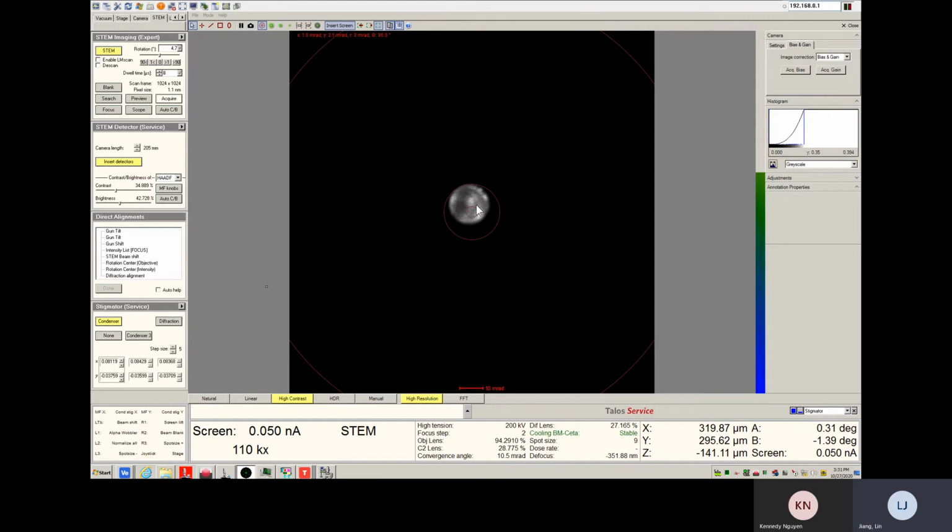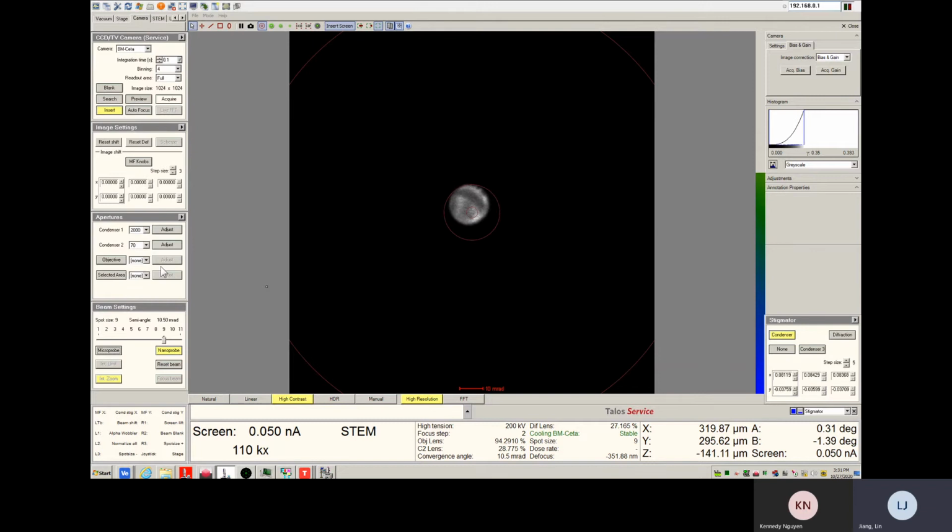Okay, and then you see you're getting close, you probably need to adjust your position of your camera a little bit. C2 position with C2. You move to the center. You want to make sure you select the center of your kick button. Okay. Good. And then we can do a little bit of fine adjustment. Make sure you remove. Okay, now it's good.